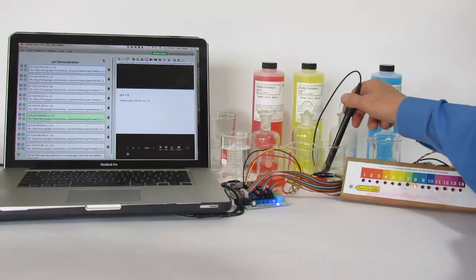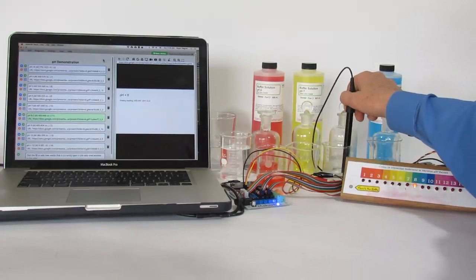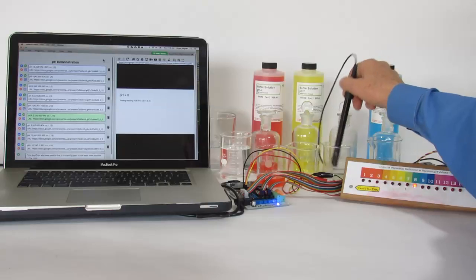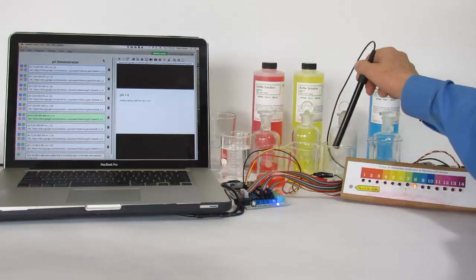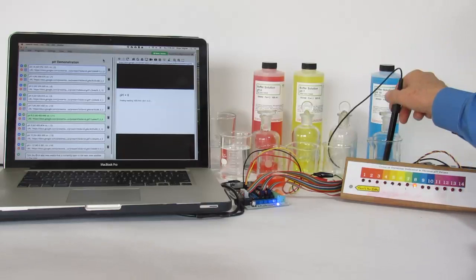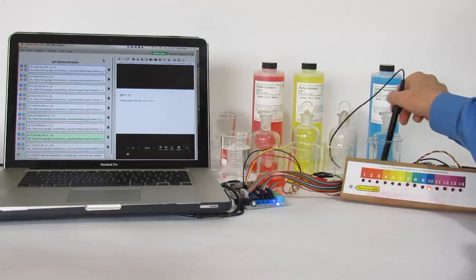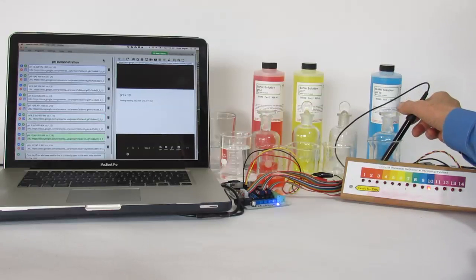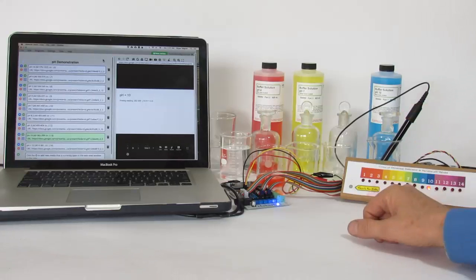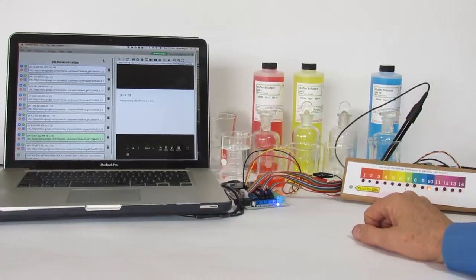Our last one is 10. That'll take a little while, but we'll move it there. Agitate a little bit. And actually, that went pretty fast. Now it's on 10.